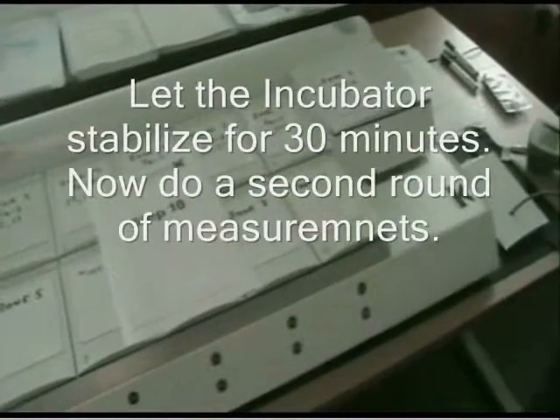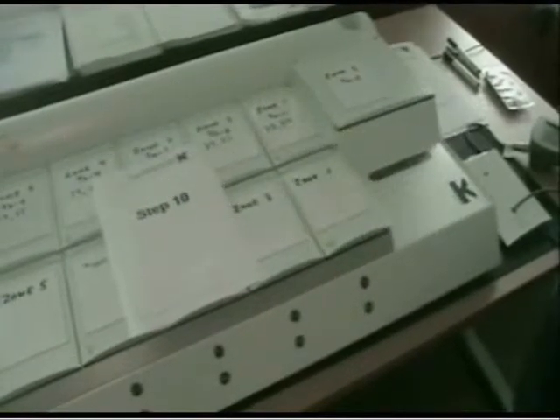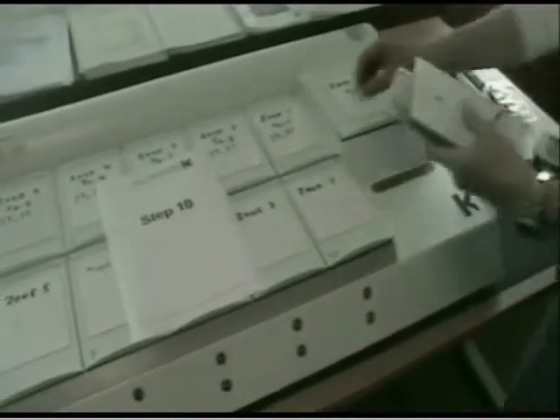We have let the G185 stabilize for at least 30 minutes. We are ready to do the second series of measurements on our zones. We start out in zone 1, which is compartment 5 and 10, as we did the first time, and we place the sensor there.